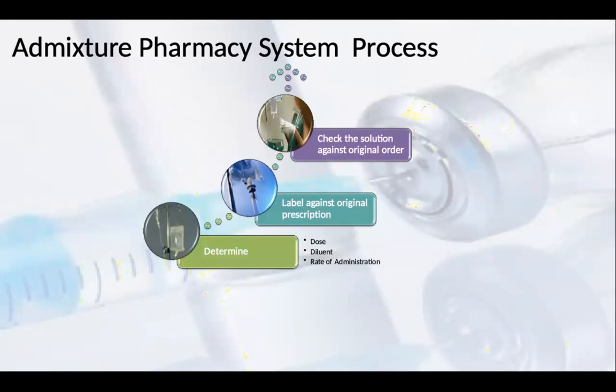Now, what is the pharmacy system process? Check the solution against the original order. Whatever prescription has been received, you have to find out the stock, then label against the original prescription. Whatever label is required, then determine its dose, diluent, and rate of administration. So we have three processes: check the solution against the original order, label against the original prescription, then write the dose, diluent, and at what rate it has to be applied to a patient after the pharmacist has prepared the mixture.